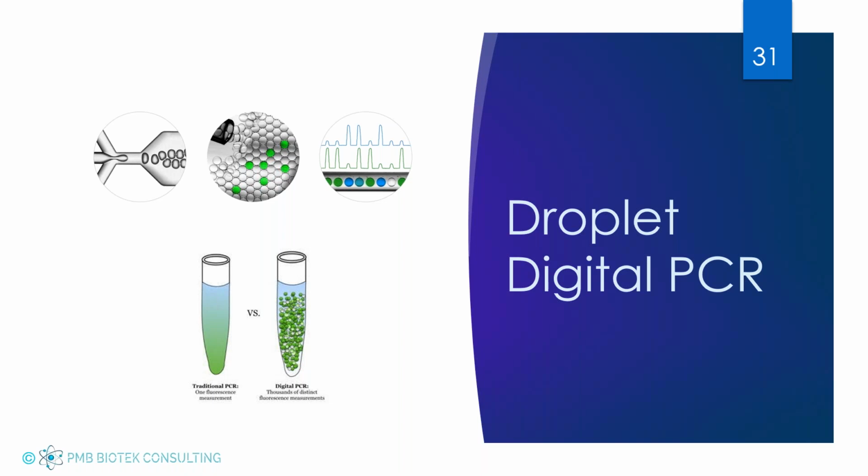So this type of technology could really be a game changer when we start to talk about, I want to do total yeast and mold, total coliform on my qPCR, and I want it to be extremely accurate. Digital droplet PCR is the way that kind of occurs. Now, unfortunately, this is a patented process right now, so only one company is really exploring it. So we have to wait a little bit before this becomes more popular in the cannabis industry.